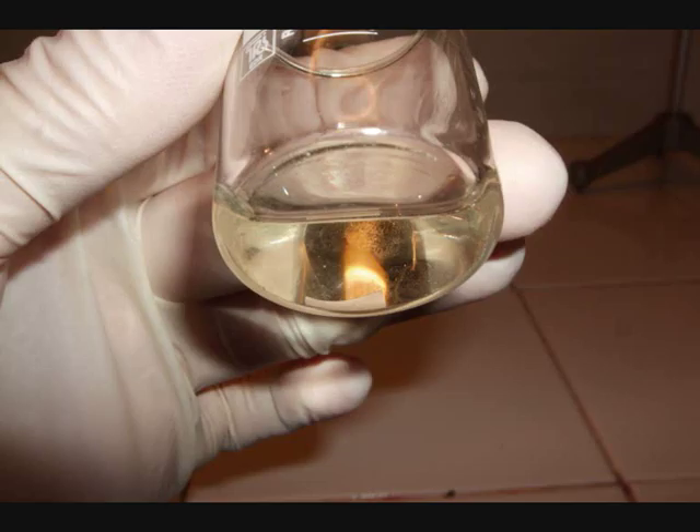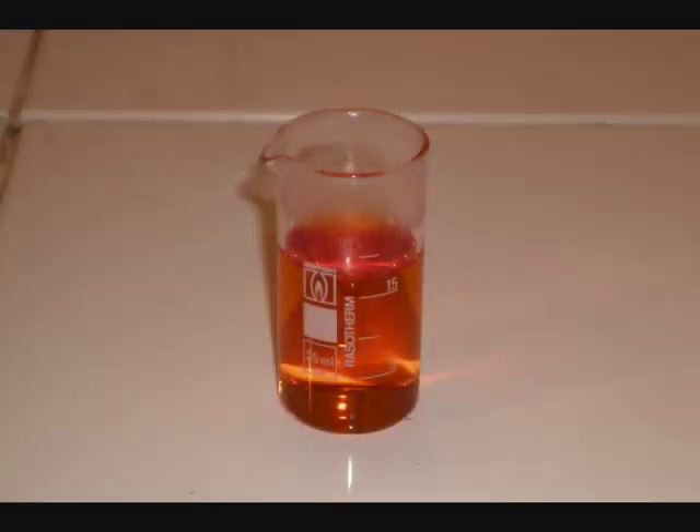Here you can see the corroded gold. And here's the rest of the aqua regia and the chloroauric acid.